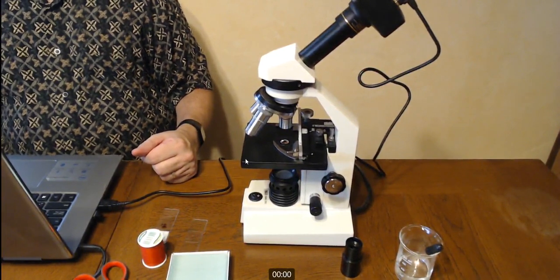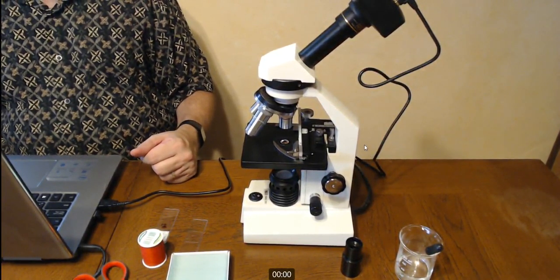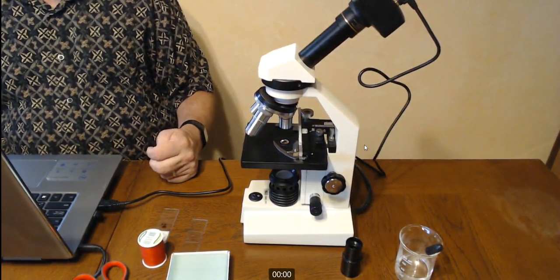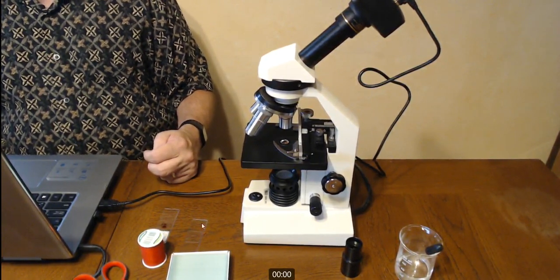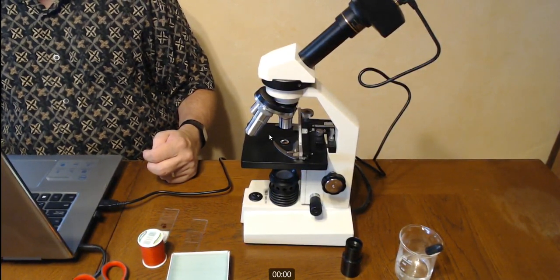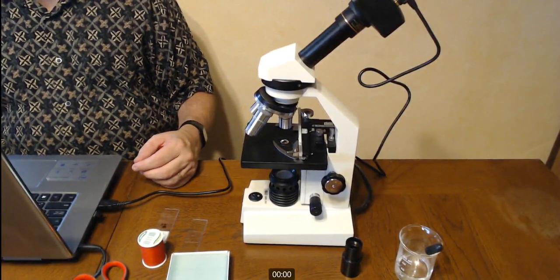You're going to see a lot more of this as we look at many prepared slides of different microorganisms as we move into Monera. Bacteria is a little harder to see. We need even higher powered microscopes, but you can see a little bit. And then Protista. Then the eukaryotes, when we get into those, they're much larger and a lot more interesting stuff.